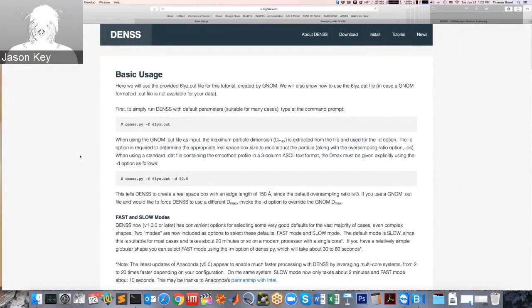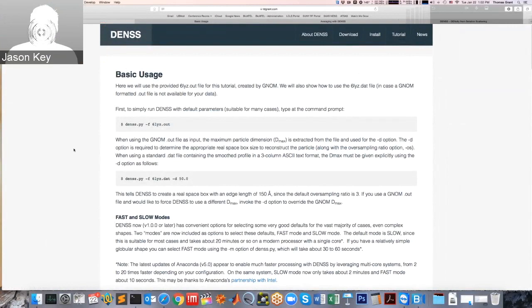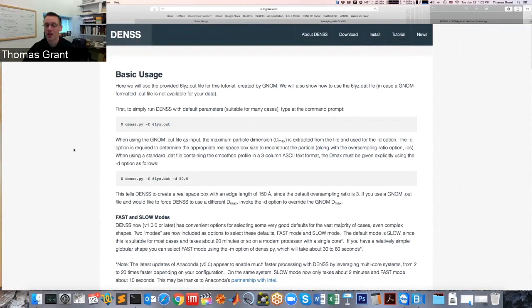So at this stage, no. I haven't looked enough into it to know for sure. My anticipation would be that it's not going to help a whole lot, and the reason is just because it's too low resolution. The primary limitation of this is just the number of pieces of information you have to reconstruct an object. And so it's going to be low resolution. One of the questions that I get asked a lot is, if you give it wide-angle X-ray scattering data, do you get higher resolution than if you give it just SAXS? And the answer is generally no.